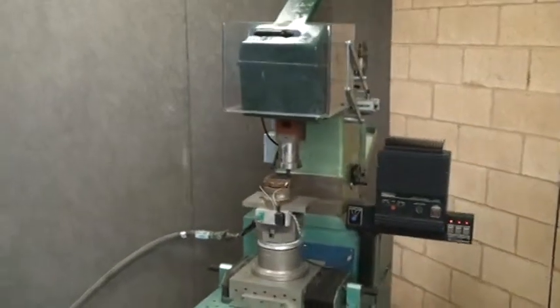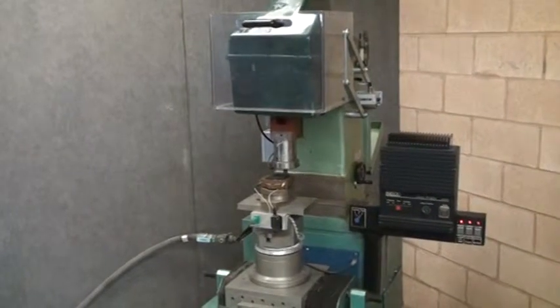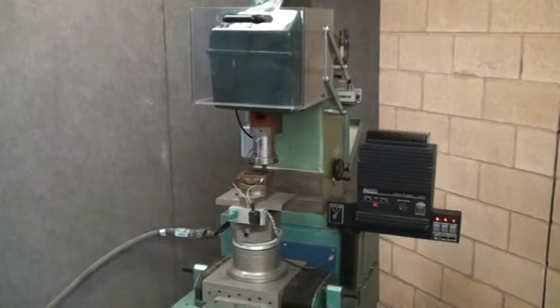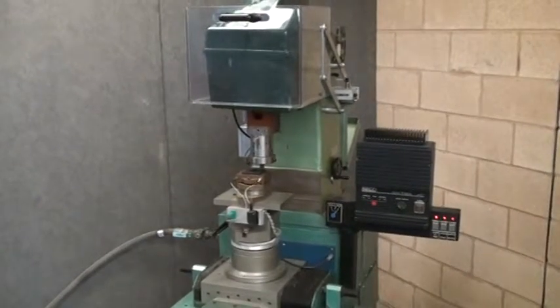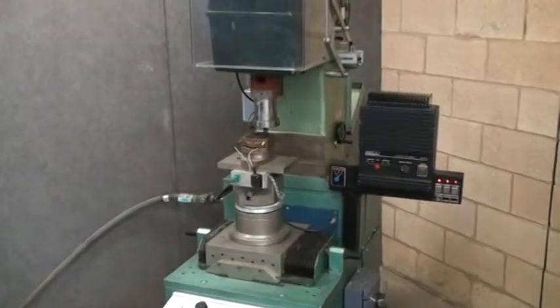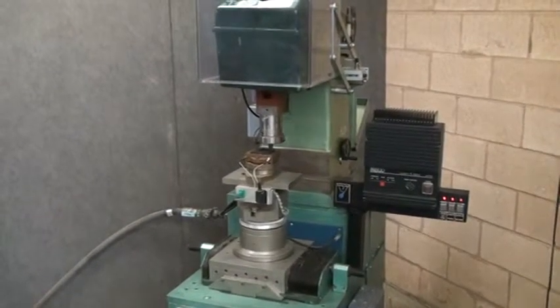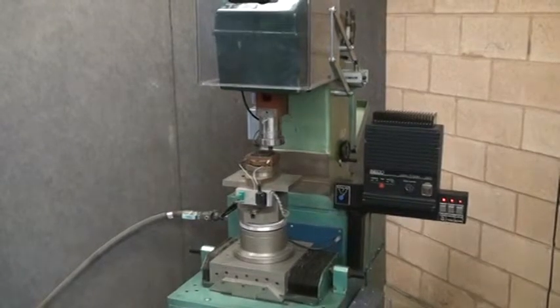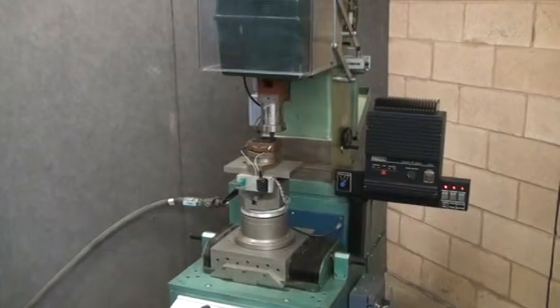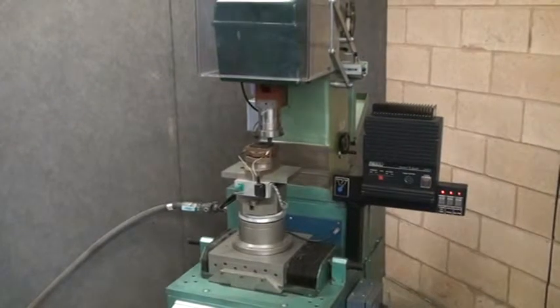The machine has multiple modes of testing. One mode is vertical impact where the top comes down and stabs into the rubber sample. Another is the abrasion test where the bed oscillates back and forth and the top comes down and scrapes back and forth on the sample. The third is a rotational test where the platen spins and the top comes down and drags into the spinning sample.